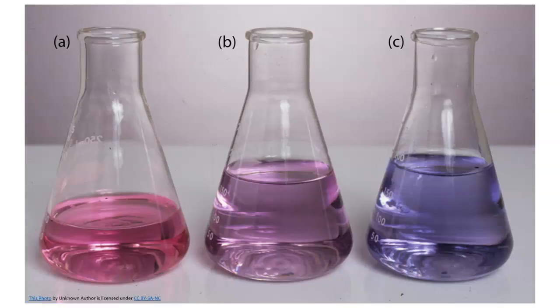So an indicator is selected so that the color change is going to occur as close to the equivalence point as possible. For any given acid-base titration, a good indicator changes color over a pH range that coincides with the portion of the curve near the equivalence point where the pH rises really sharply.